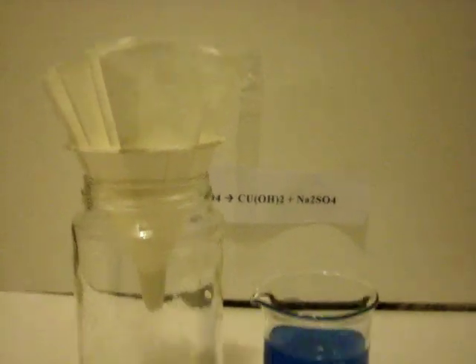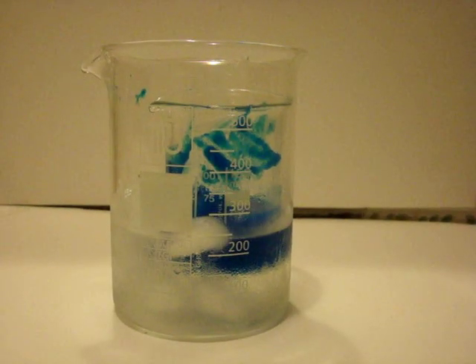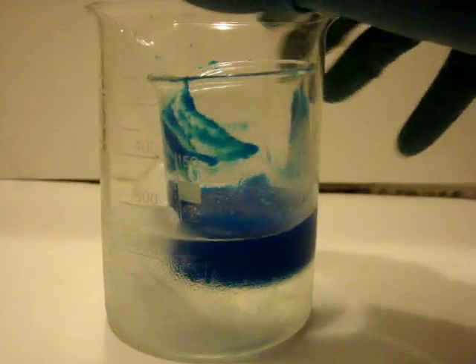After, filter through paper filter the hydroxide and put it into a larger beaker full of ice. It is important to keep the copper hydroxide cold for the next step, or it will decompose into copper oxide, which is unusable for this reaction.